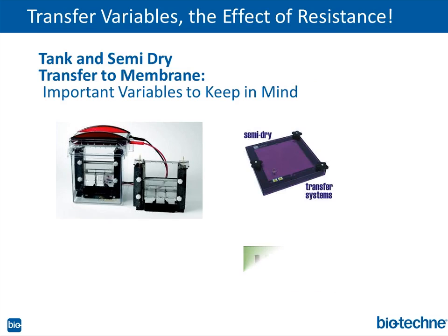So let me put an equation here. I usually poll my audience when I give this live, and I ask folks, whose law is this? I get one or two people who answer, and they'll say Ohm's law, and of course it's Ohm's law.